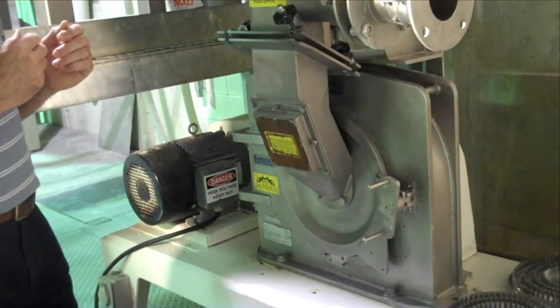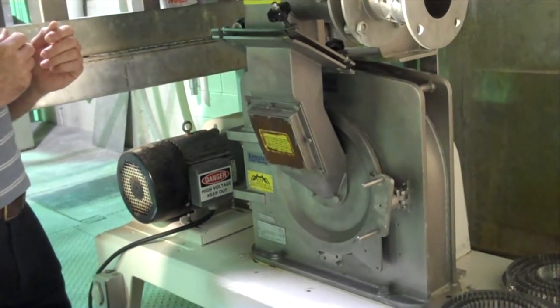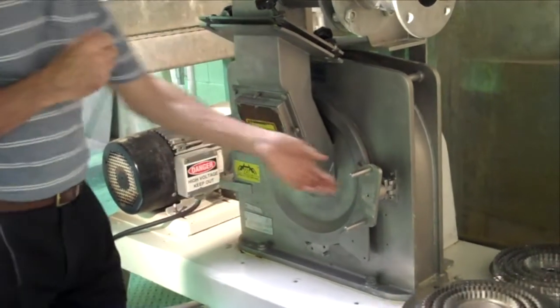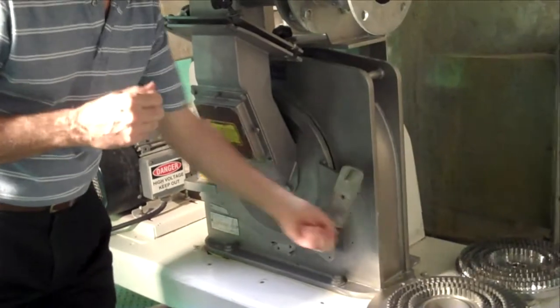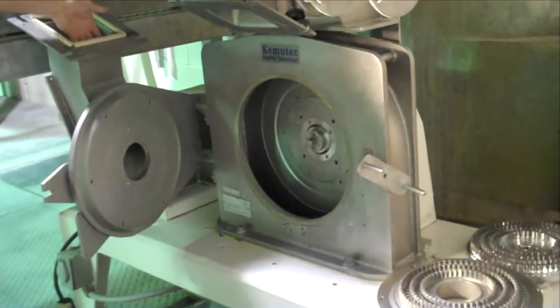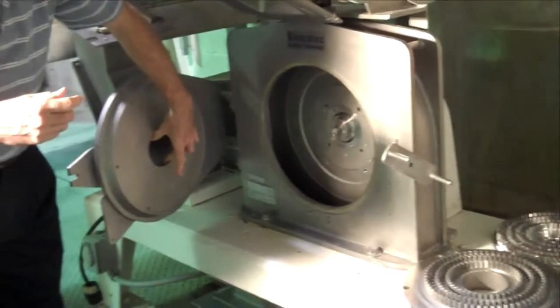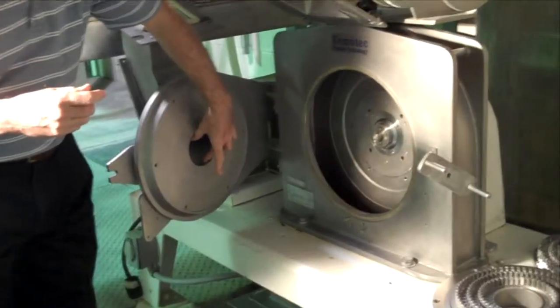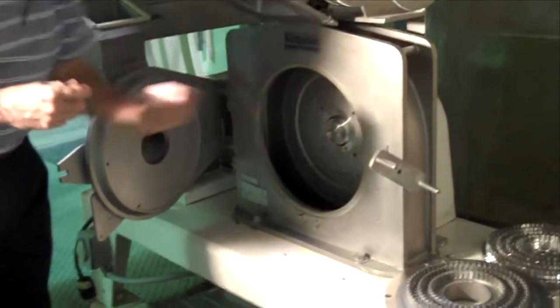As a universal mill, the unit can be fitted with interchangeable grinding media which fits inside the main body of the mill here. You can see the inlet coming in and the product passing through the center of the door into the main grinding chamber.